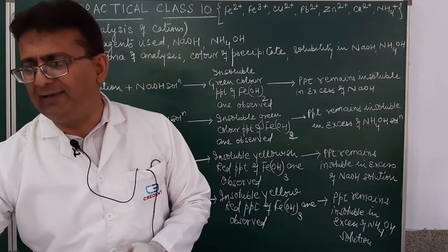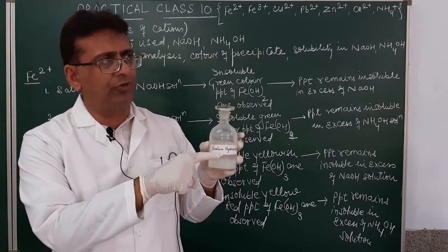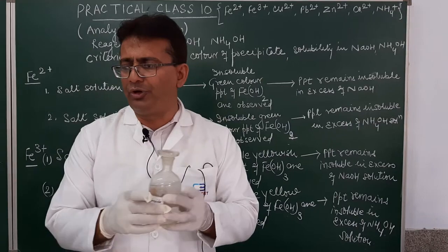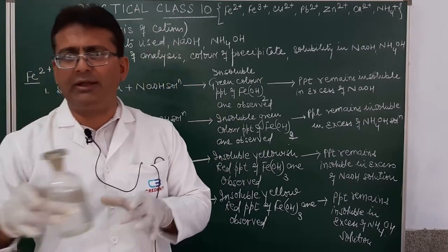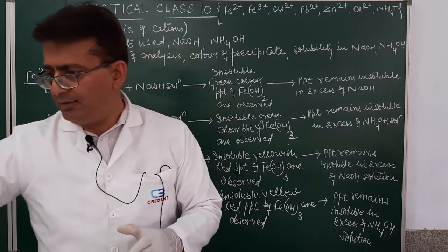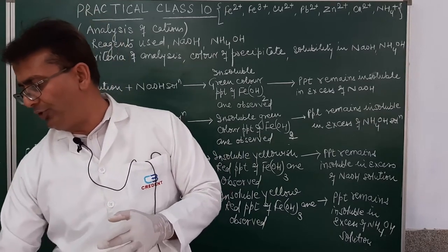This is a reagent bottle. As you can see over here, sodium hydroxide is written. So this is a reagent bottle of sodium hydroxide. Then this is a reagent bottle of ammonium hydroxide. Then we have prepared 3 salt solutions for you.